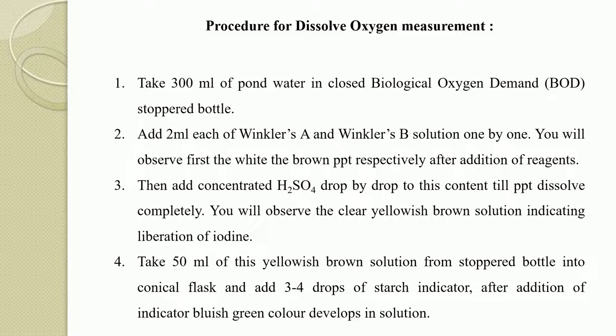You will observe a white and then a brown precipitate respectively after the addition of these two reagents.